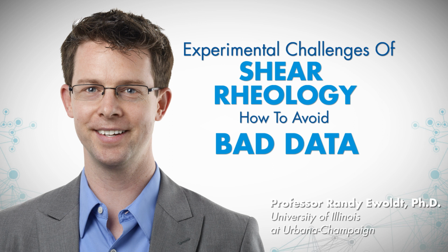But really, making measurements with two different geometries is by far the best way, independent of what the problem is, to see if what you have is really a true intrinsic property that you're measuring in the results. Yeah, I guess I'd certainly offer, in my own experience, you commented on the importance of underfilling versus overfilling, and that's probably one of the most difficult and yet necessarily manual steps of the process, and certainly a place where error and spreads in the data can appear. So, that's right. That's right.